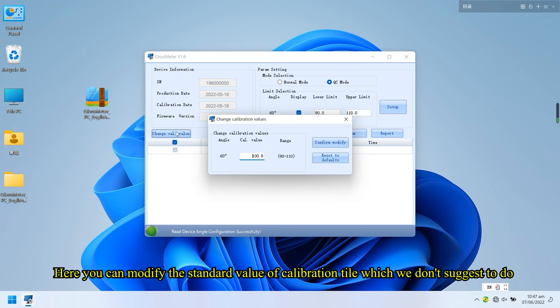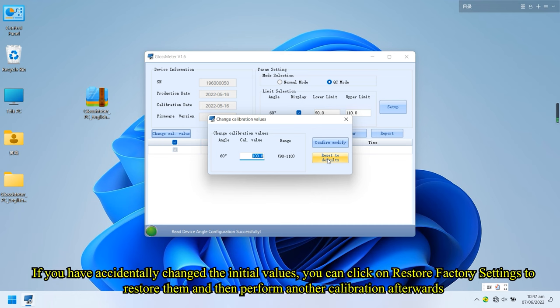Here you can modify the standard value of calibration tile, which we don't suggest to do. If you have accidentally changed the initial values, you can click on restore factory settings to restore them and then perform another calibration afterwards.